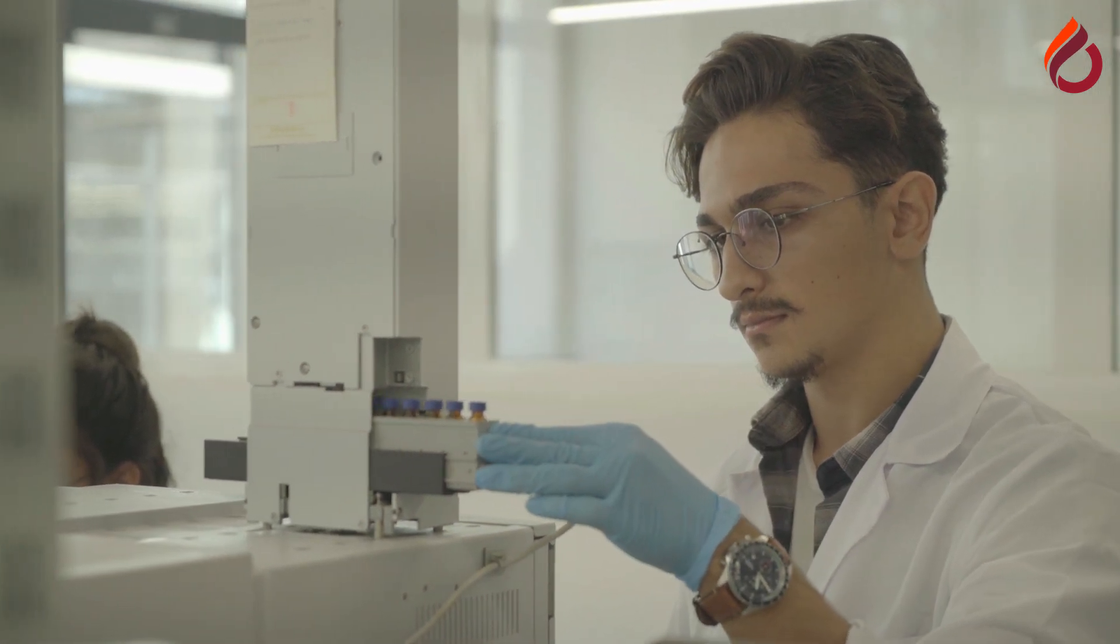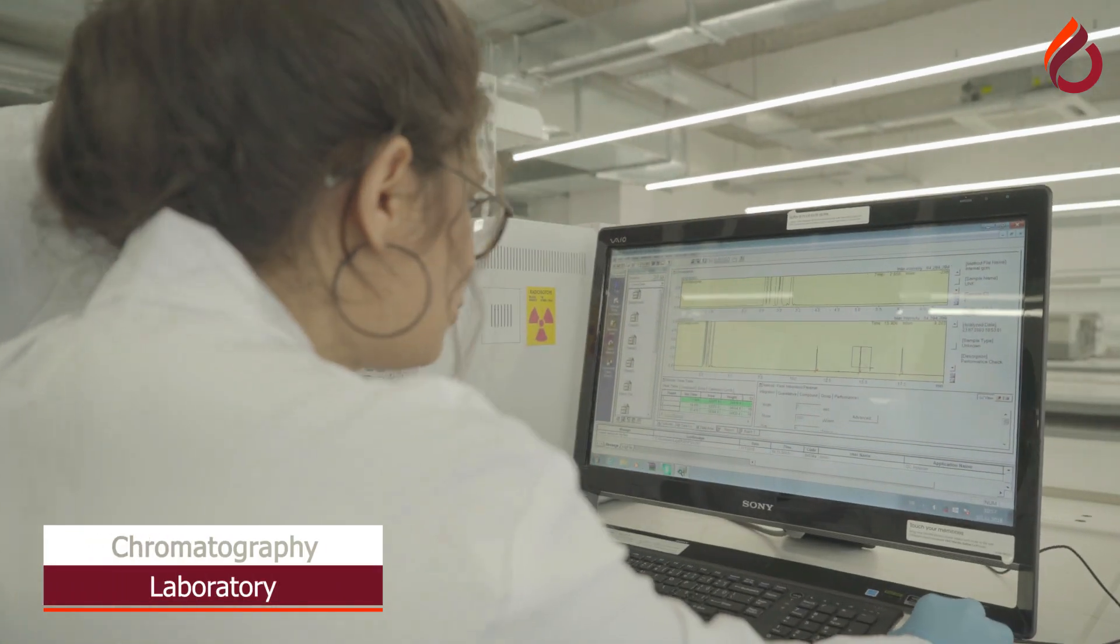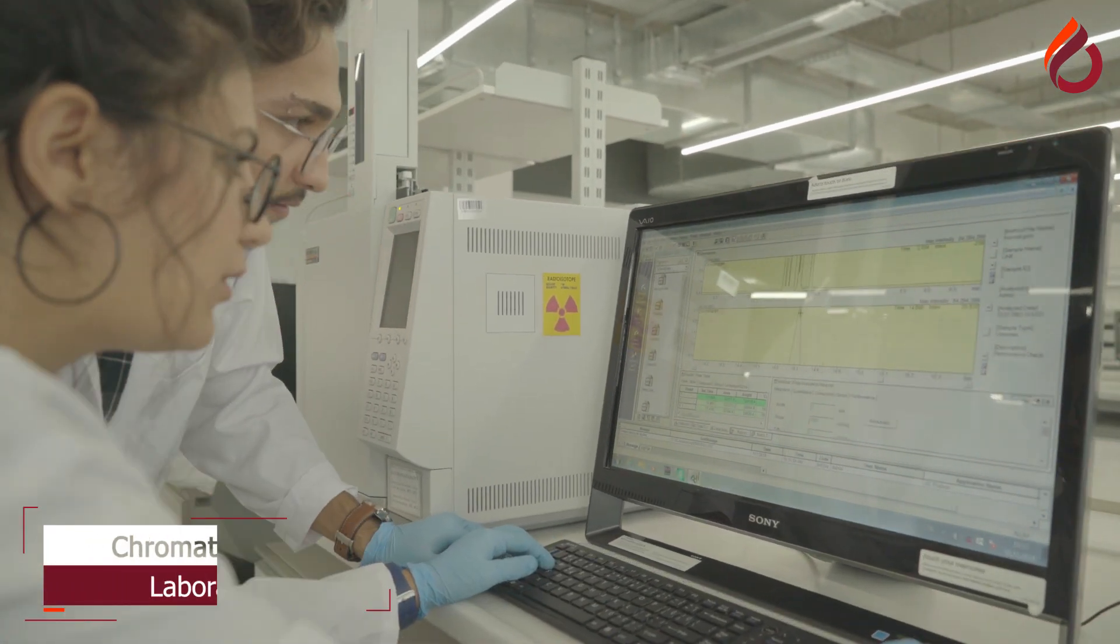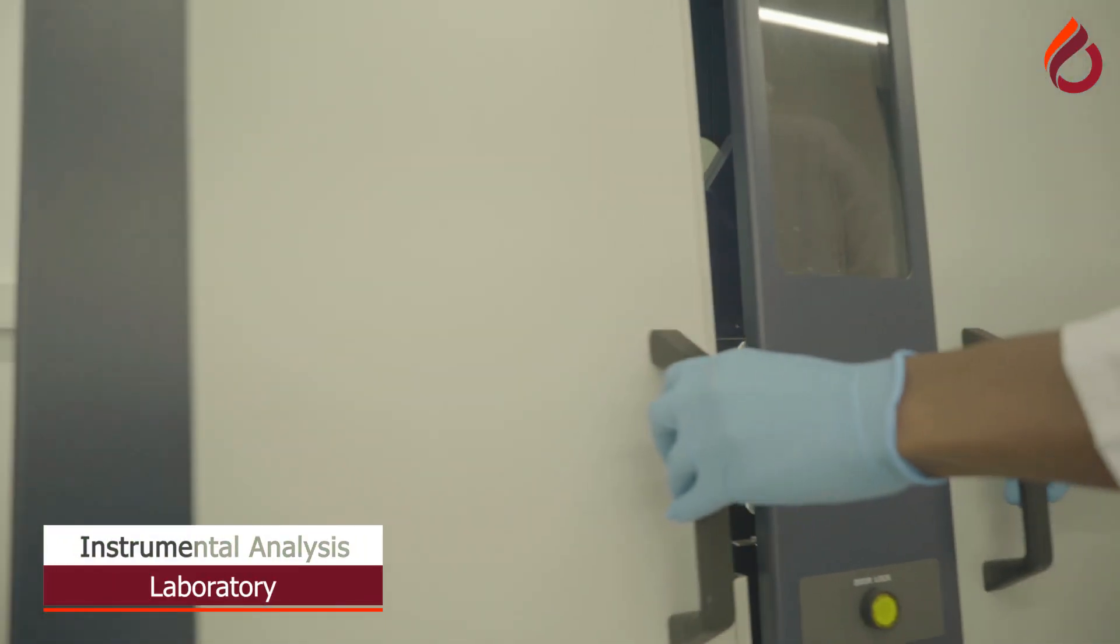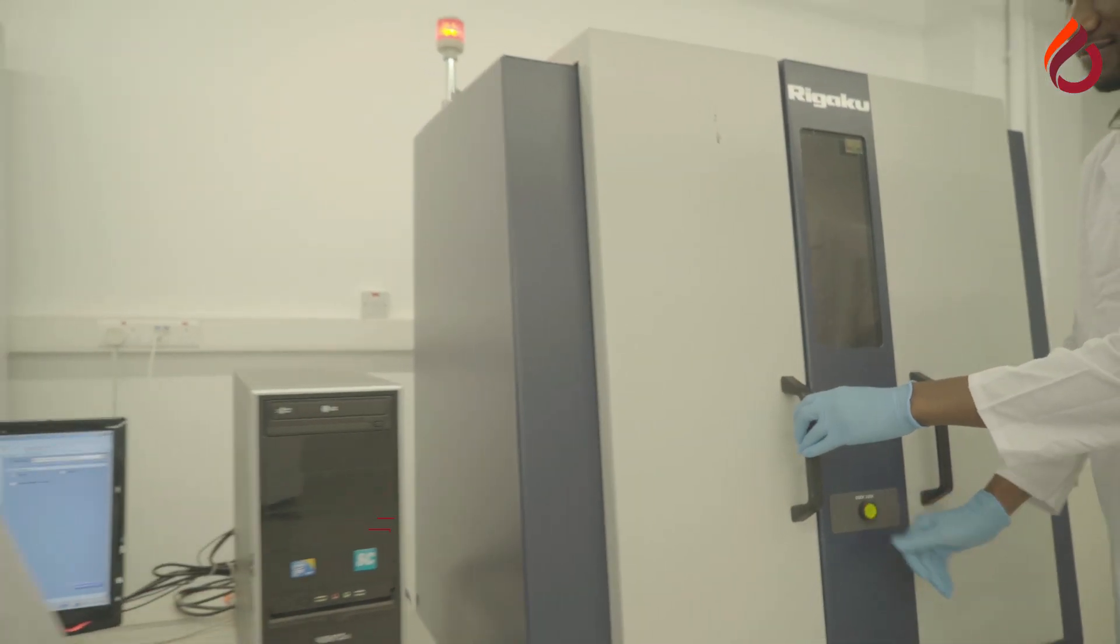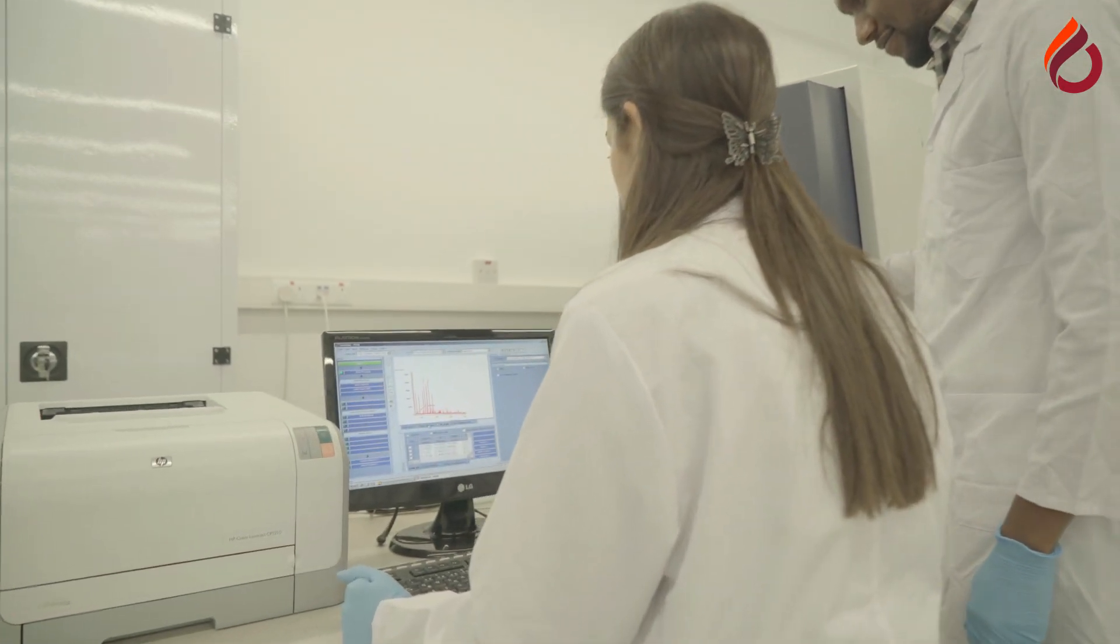Cyprus International University is one of the leading higher education institutions in the region, pursuing a mission to continuously develop, innovate, emphasize experience, and develop quality standards in its more than 60 laboratories designed with powerful and latest generation technology infrastructure.